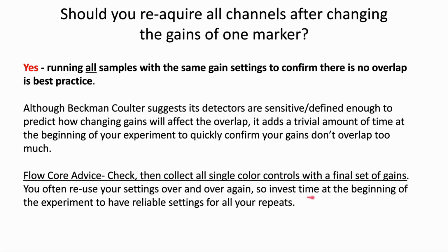So an investment of time at the beginning of the experiment will help produce reliable settings for all of your repeats.